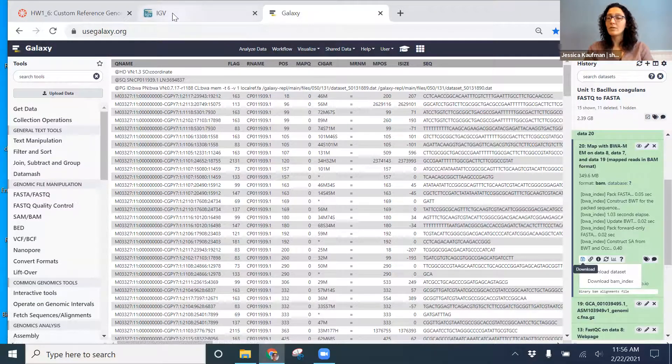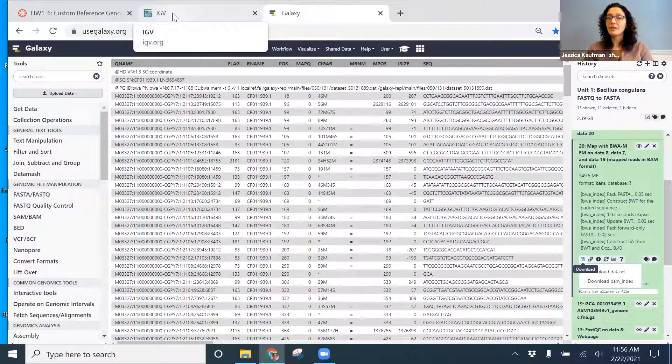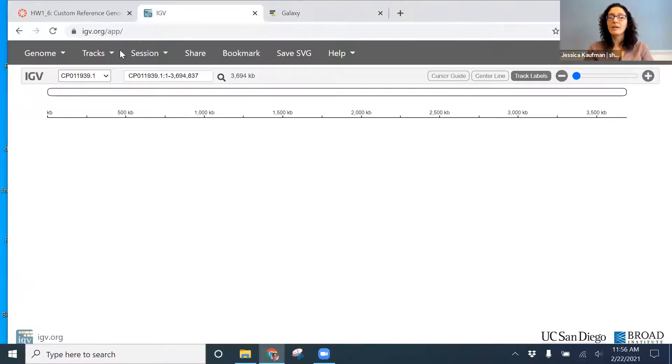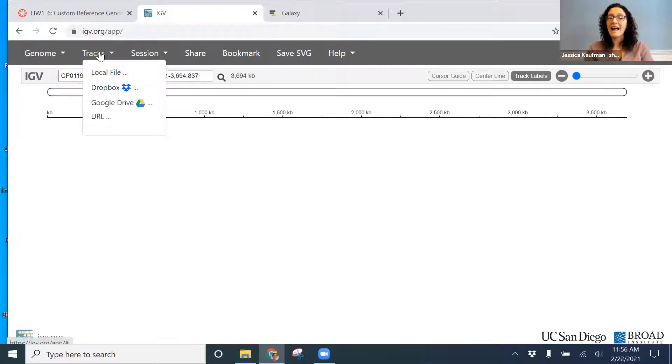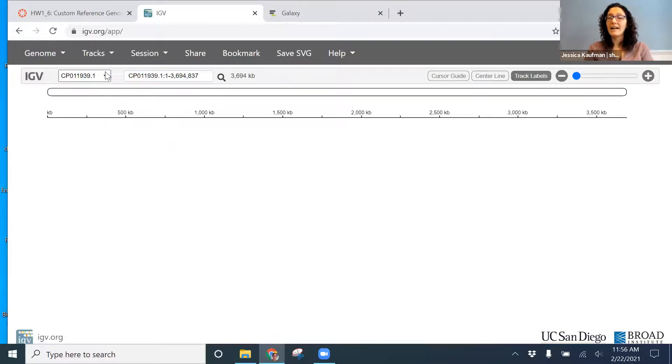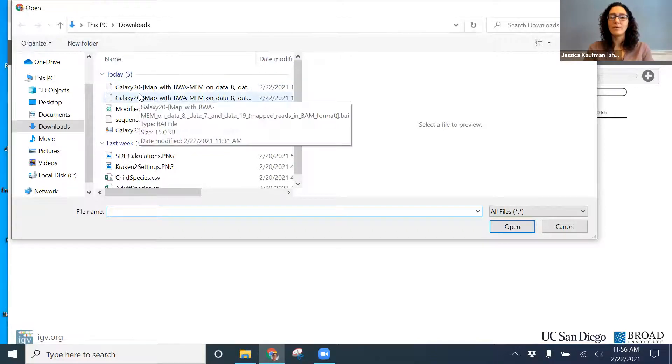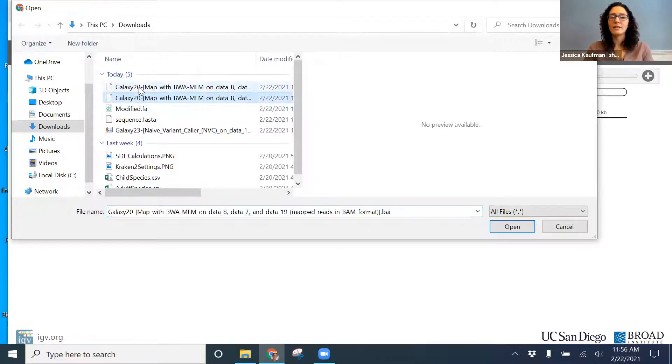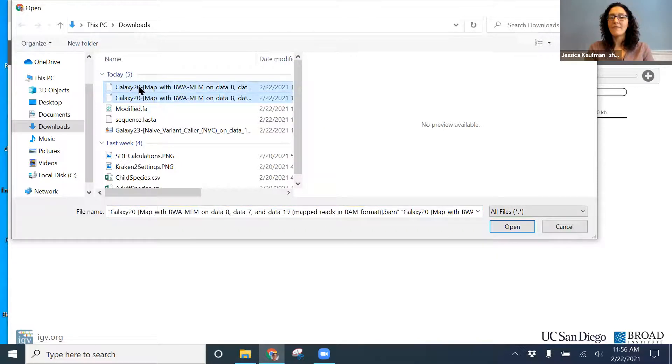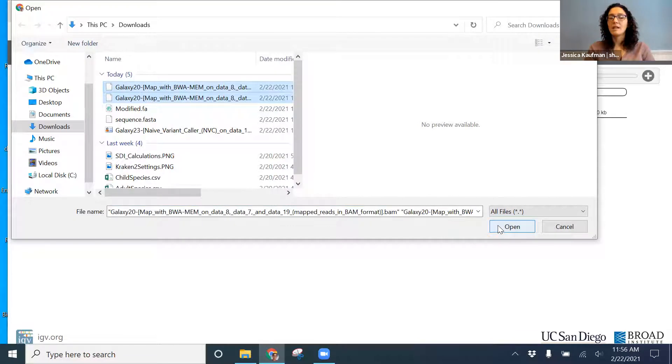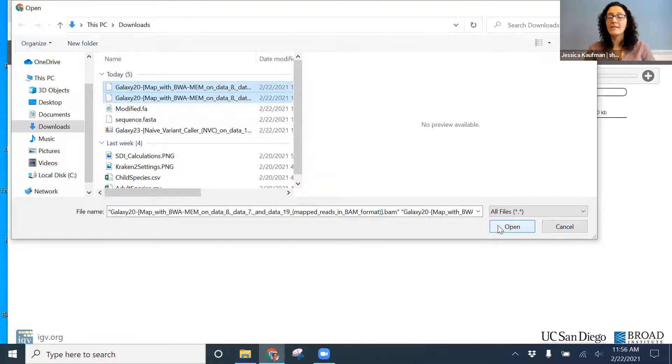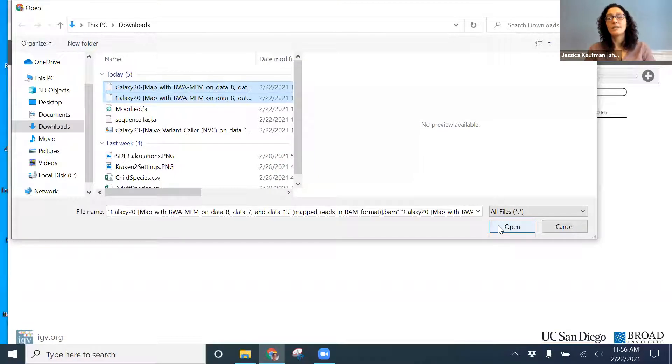Once those are downloaded onto your computer, you'll go to IGV, tracks, local file. And from your downloads, you'll select both of those, the BAI and the BAM file. I use the control key to select both files. If you're on a Mac, you want to use command.